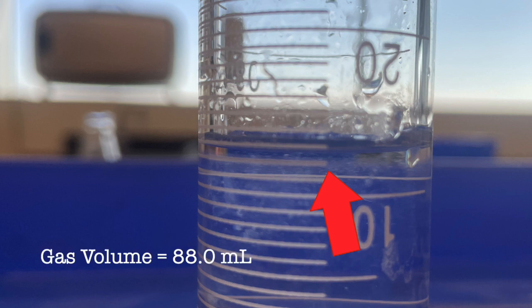After the reaction has completed, you can see the level of the liquid inside the graduated cylinder is at about 12.0 milliliters based on the bottom of the meniscus. That means the gas volume inside the cylinder is 88.0 milliliters.